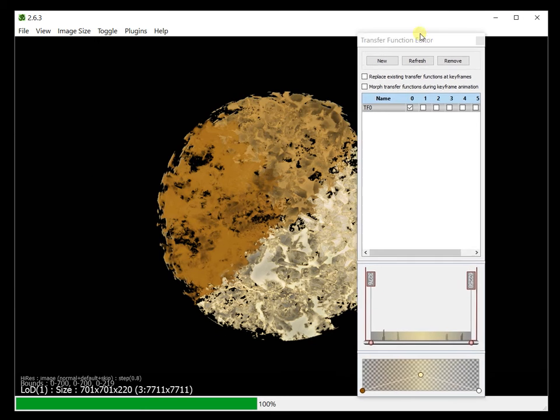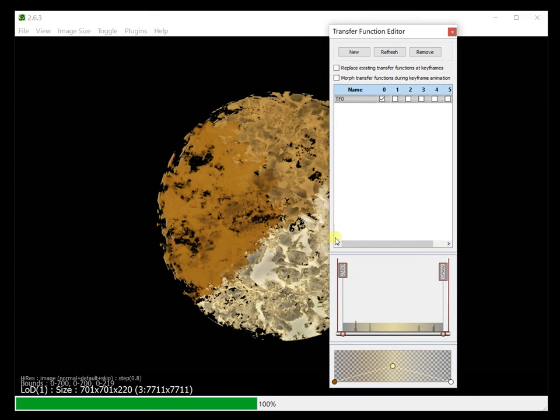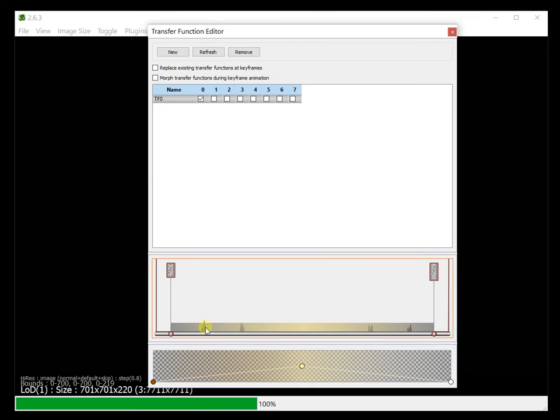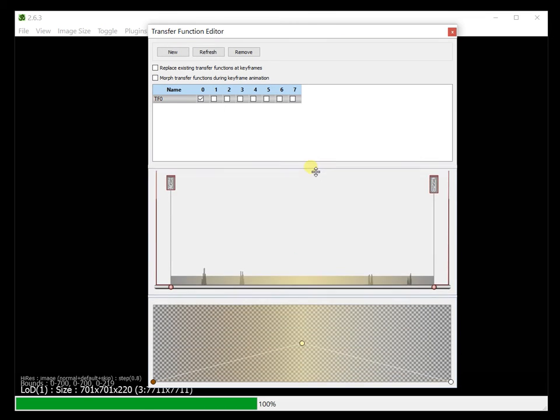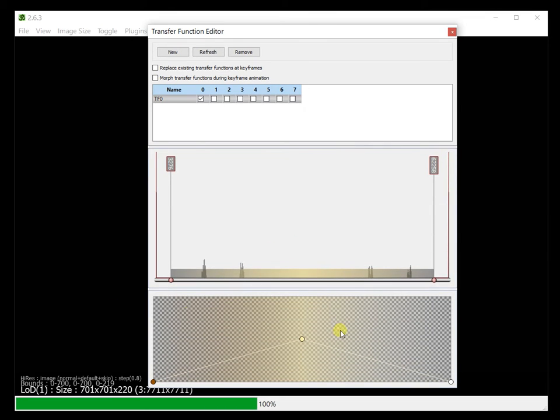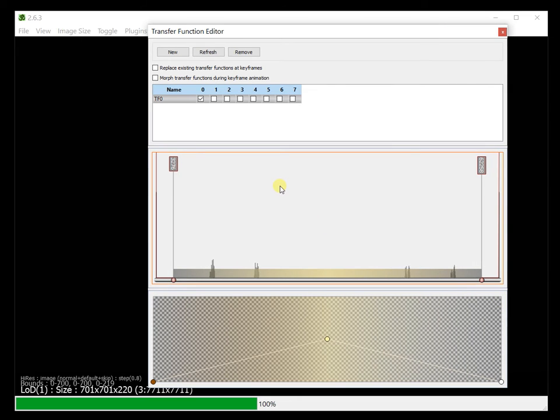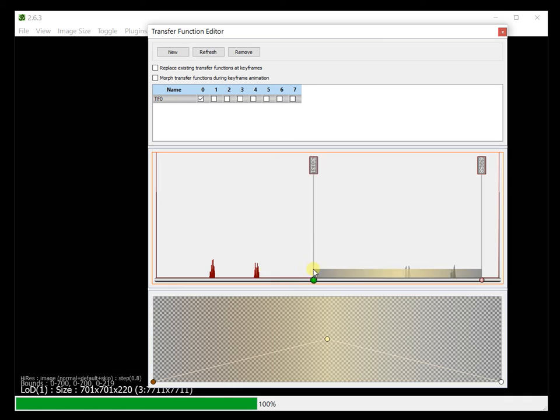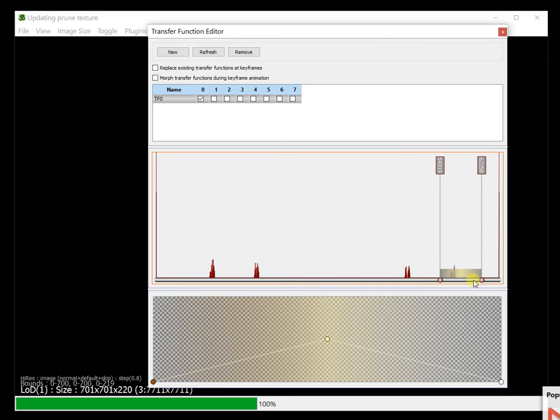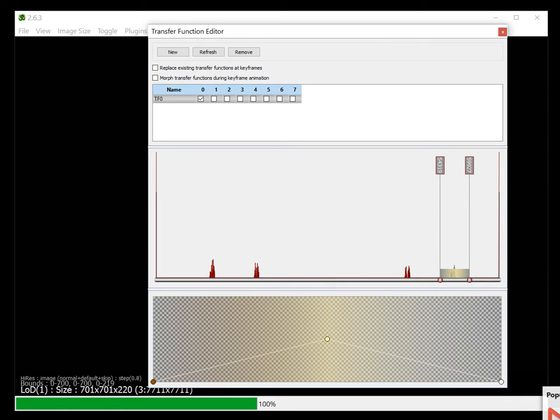Now if you look at the transfer function editor, your transfer function will now look like this. It won't be 2D, you won't see a 2D histogram. What you will see is a 1D histogram only. So it's basically these peaks here.